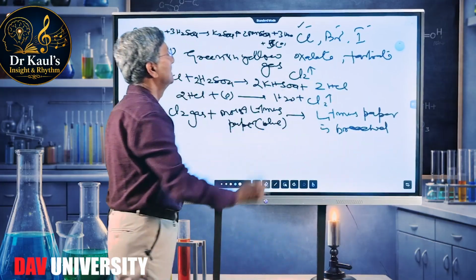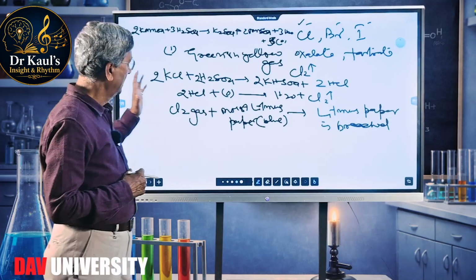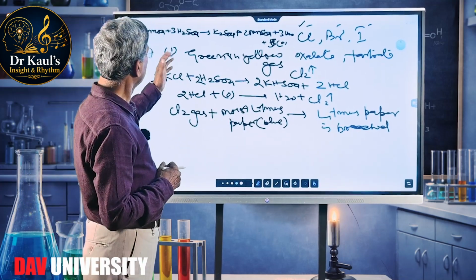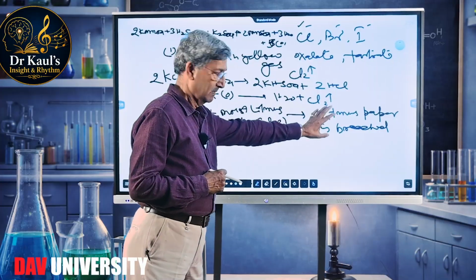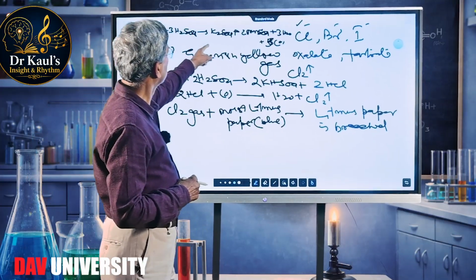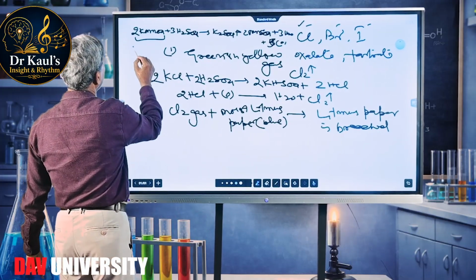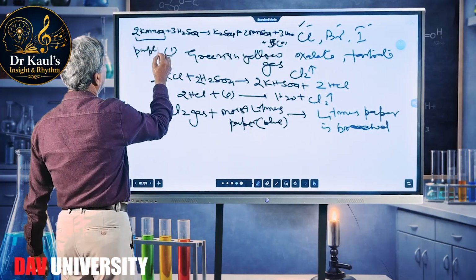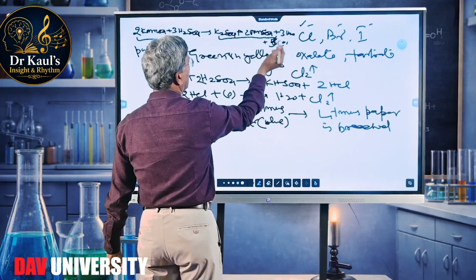So this indicates that chloride must be present in the salt, which, on coming in contact with acidified KMnO₄, bleaches the litmus paper. How? This is a basic question. I told earlier that KMnO₄ is of purple color and it gives us K2SO4 and MnSO4.